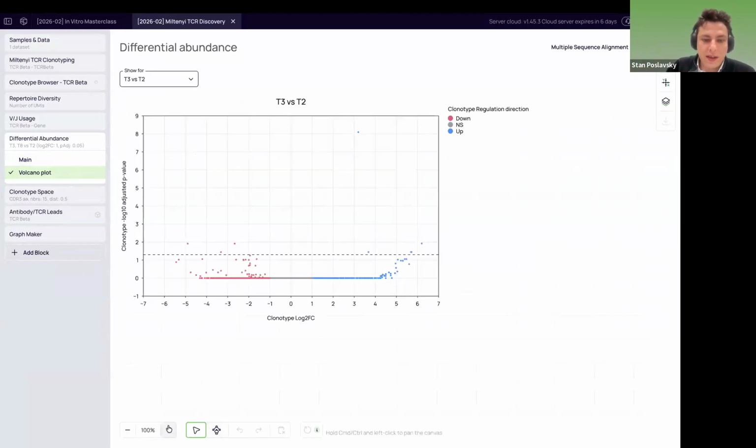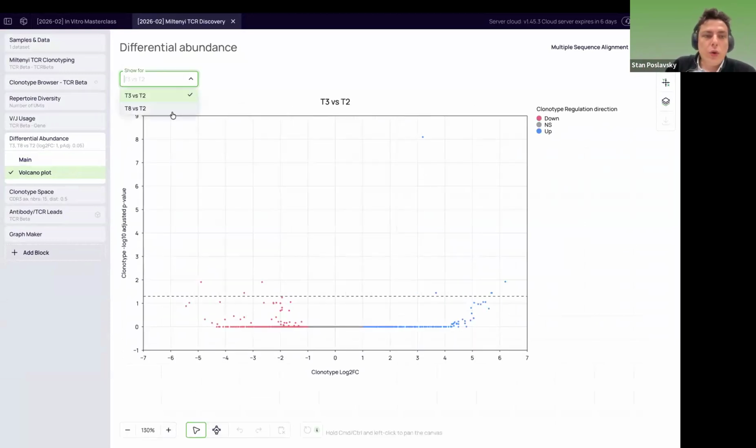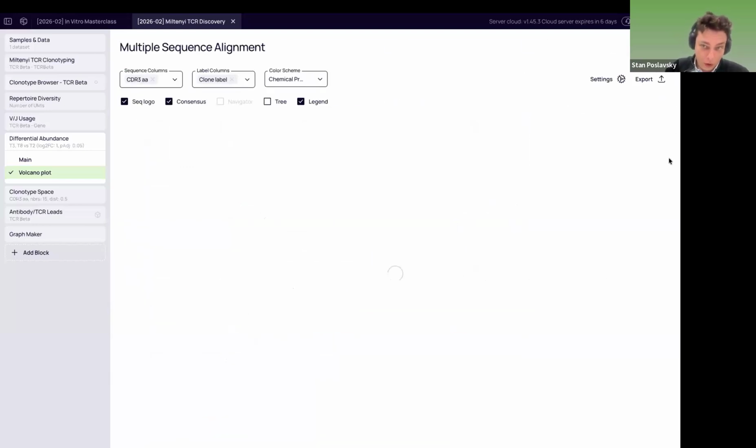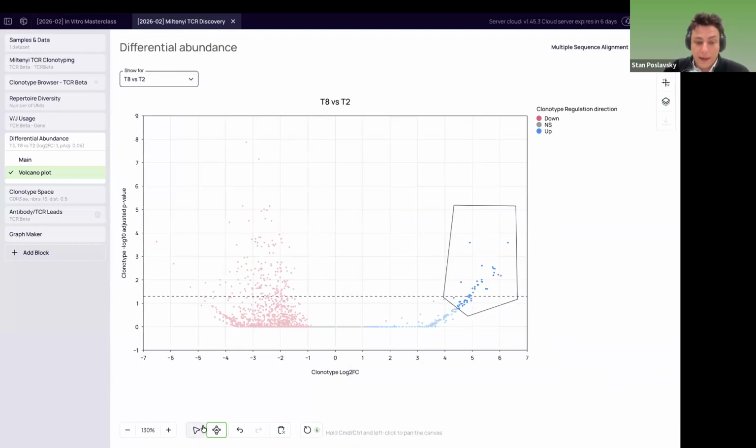It's a different project, TCR discovery, but it gives you an idea. You can run the differential abundance analysis to find those antibodies that are differentially more abundant or differentially enriched, with a p-value, on top of just log-two fold change, through your campaigns. And this gives much more statistical power, of course. Yeah, it's very nice. But as I said, for just standard display campaigns, it's very rare when people do this.